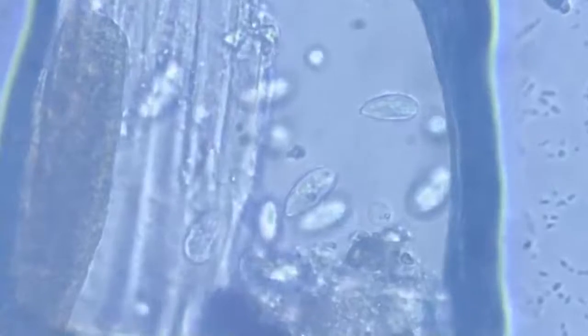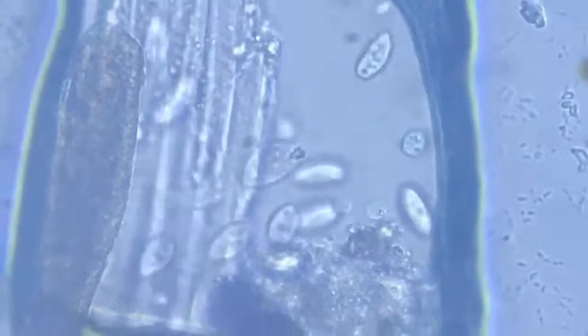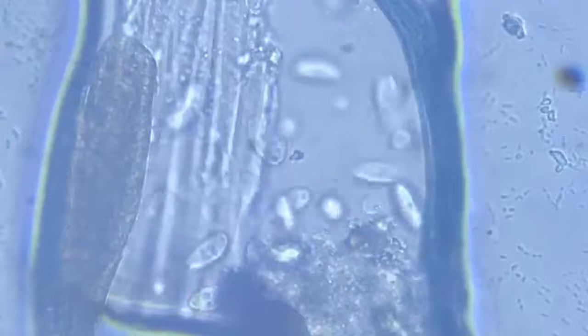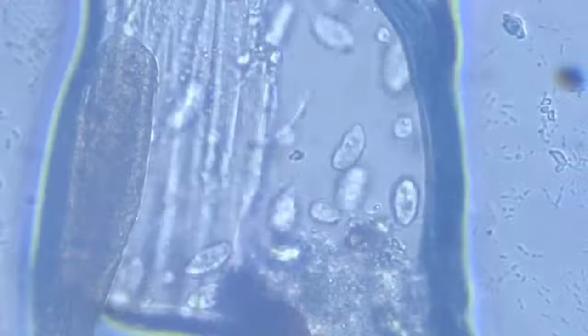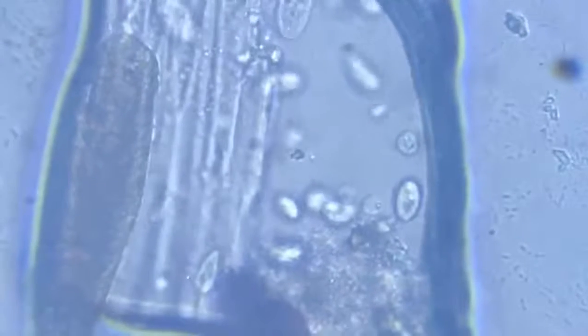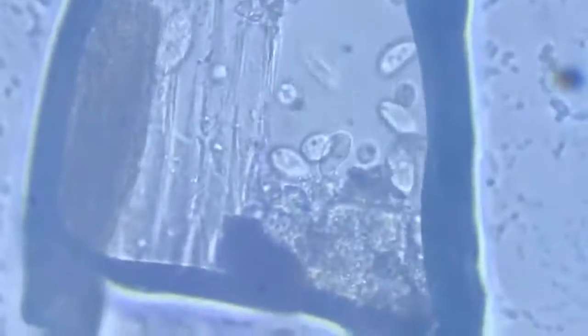Should they undergo cystification? Or should they just wait a little while longer and hope for the environment to become better for them? Many questions must be arising in them. We have already seen a few undergoing cyst formation.